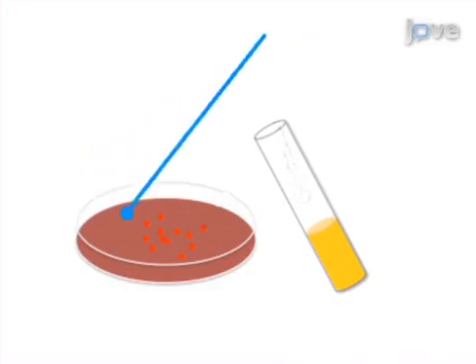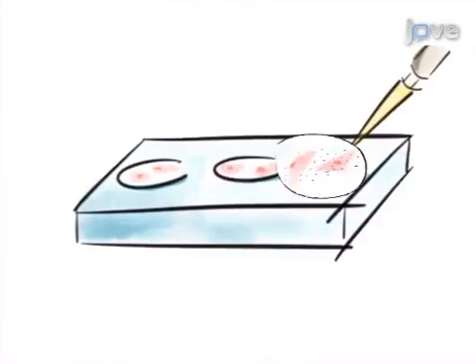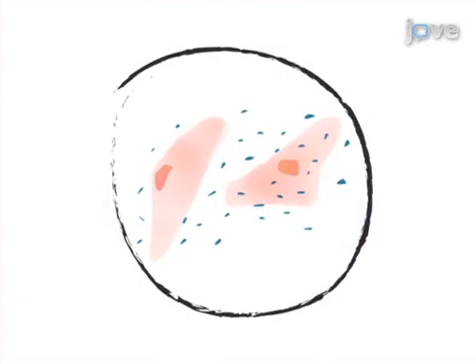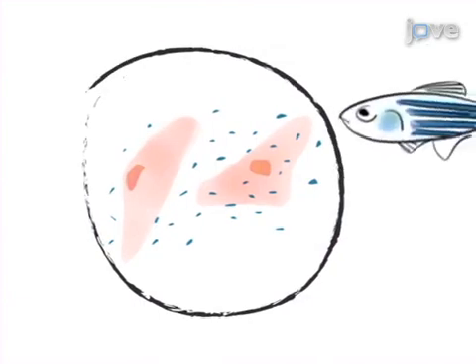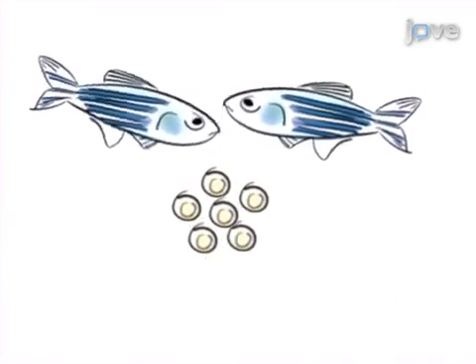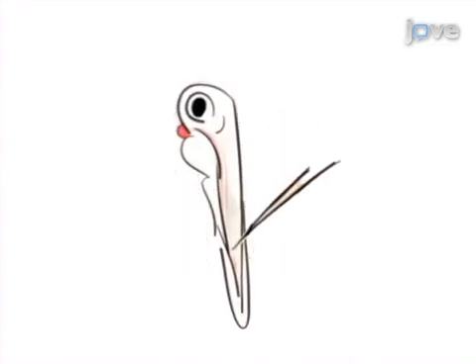The in vitro method begins with preparation of Shigella flexneri, a gram-negative entero-invasive bacterial pathogen. HeLa cells are then infected and siRNA or pharmacological reagents are used to manipulate the host autophagy machinery and cytoskeleton during infection. To study autophagy-cytoskeleton interactions caused by Shigella in vivo, zebrafish embryos are infected 3 days post-fertilization.